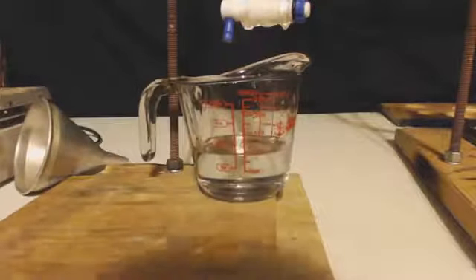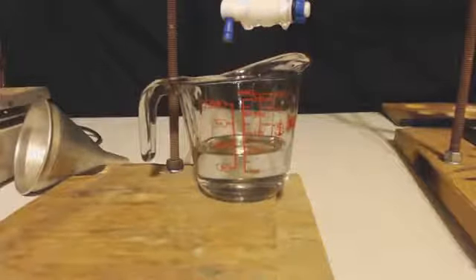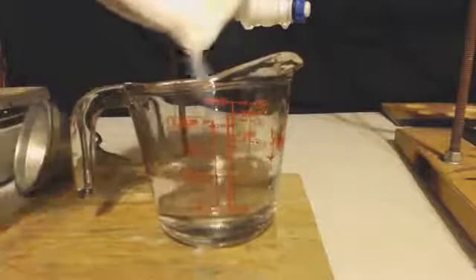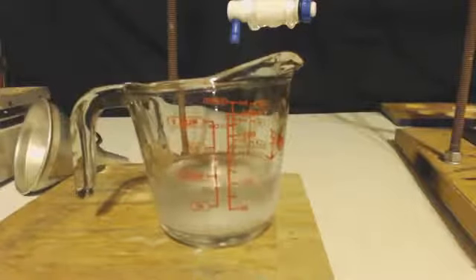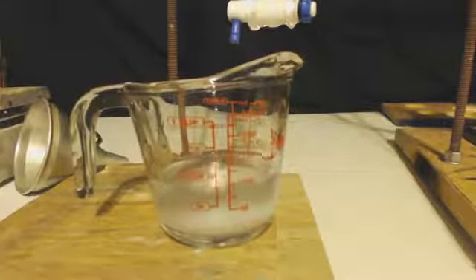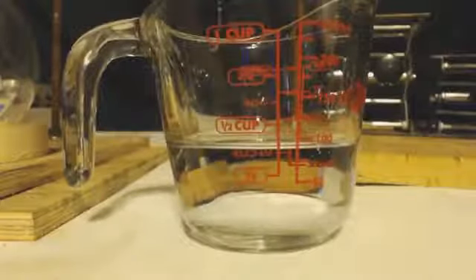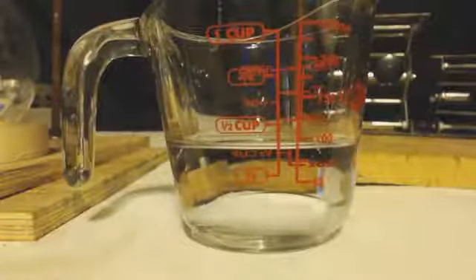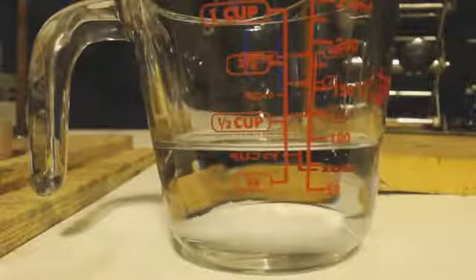Now I'm going to throw some magnesium sulfate in there, some Epsom salts anhydrous. Get any water out of there. You can see how crystal clear that is after about 20 minutes of stirring it and letting it sit. Let everything settle out.